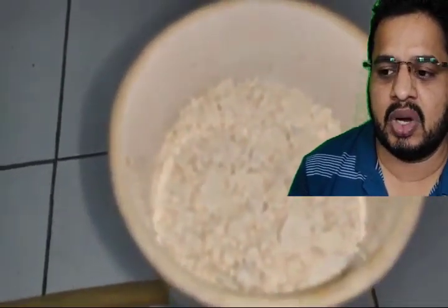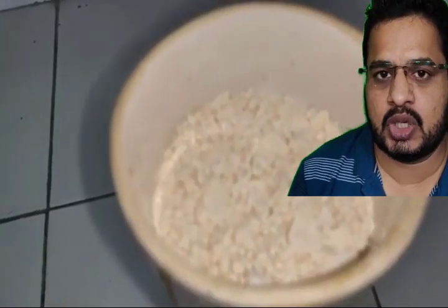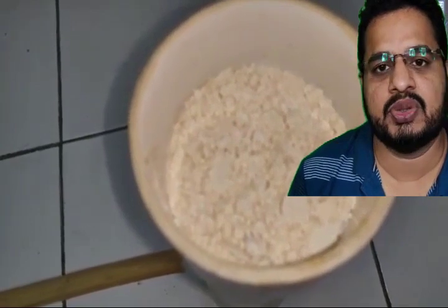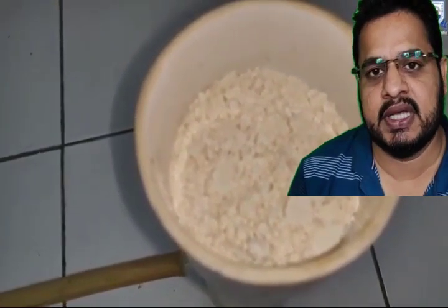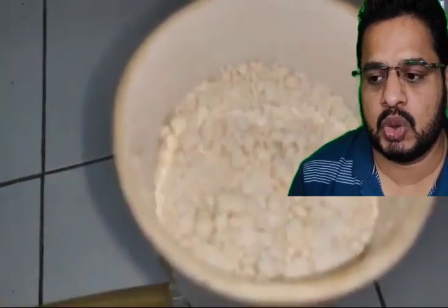Now this solid is present here in the filtration assembly. This is a crude form. So we'll add water to it, so that water soluble impurities will be washed out by getting solubilized.